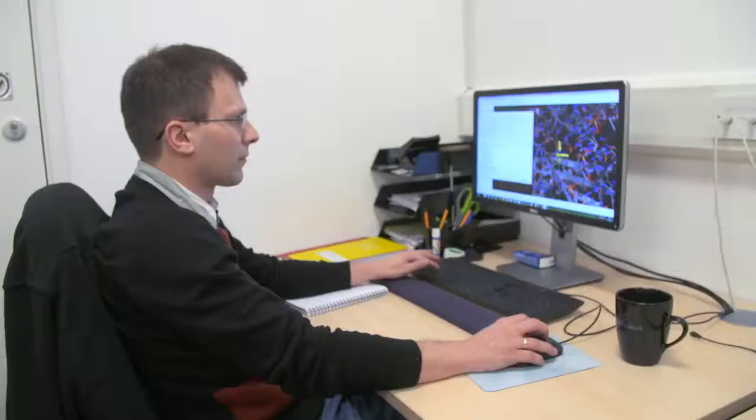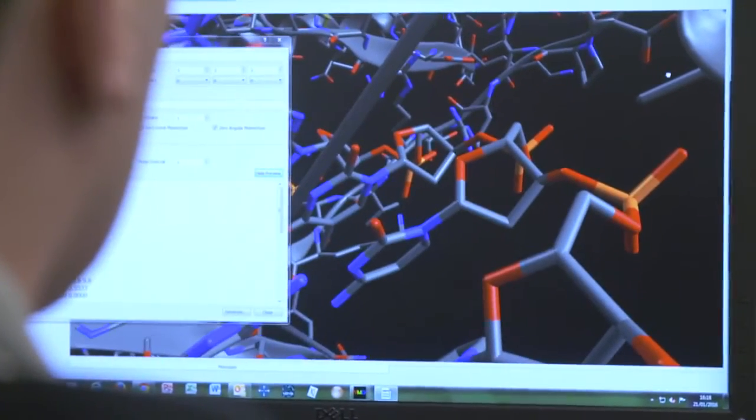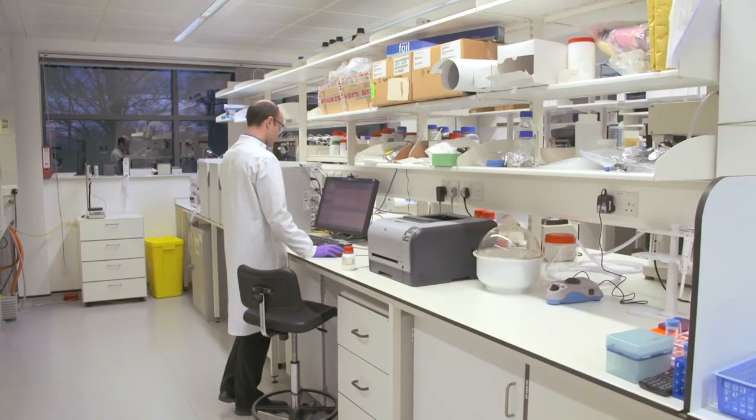People are going to be using RPA for microfluidics. They're going to be running DNA on electronic chips. The great thing about RPA is that it could make a difference in so many places: food testing and agriculture and human diagnostics. But the potential for it is almost limitless. If you need a quick test, it's kind of the thing that you want to use.